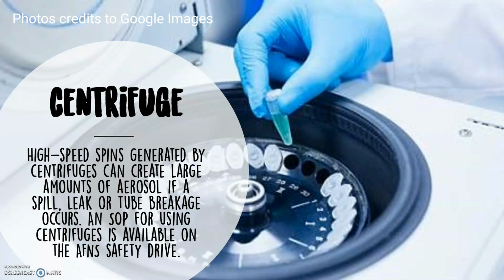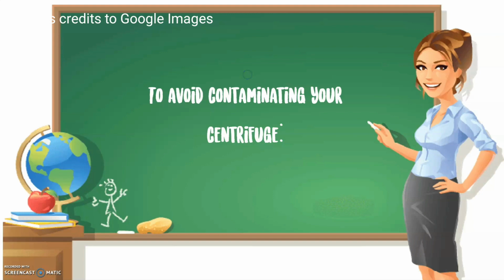The high-speed spins generated by a centrifuge can create large amounts of aerosol if a spill, leak, or tube breakage occurs. An SOP for using centrifuges is available on the AFNS safety drive.